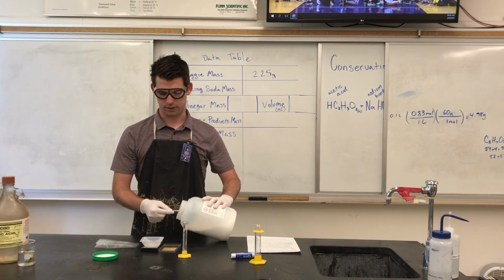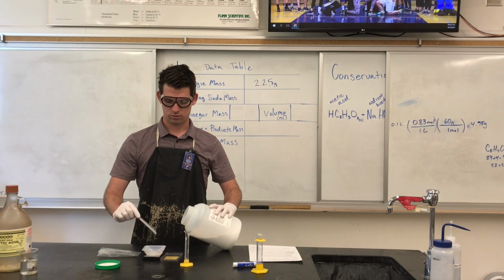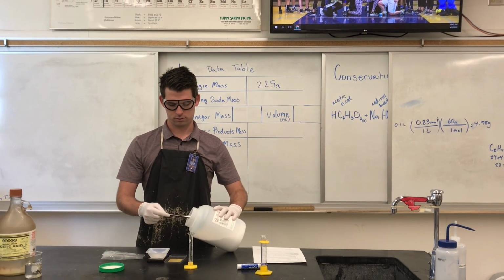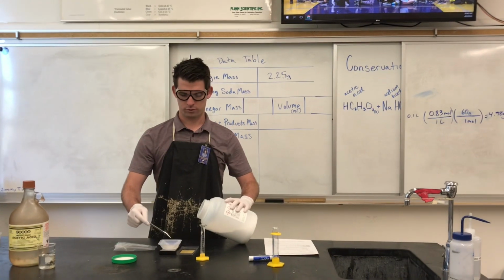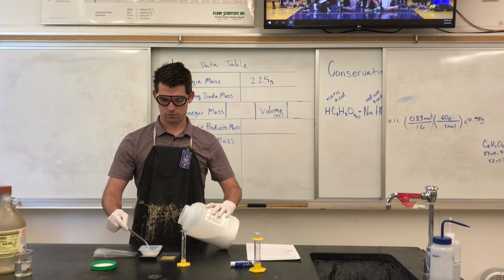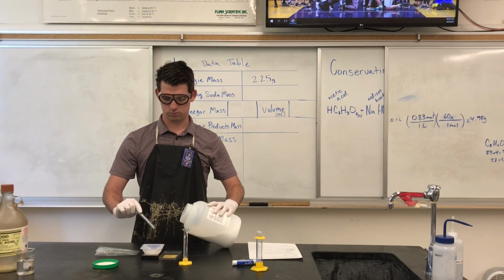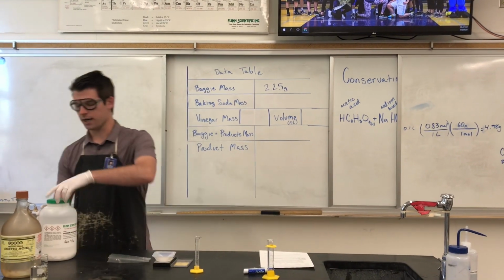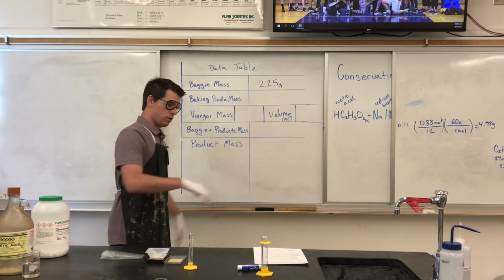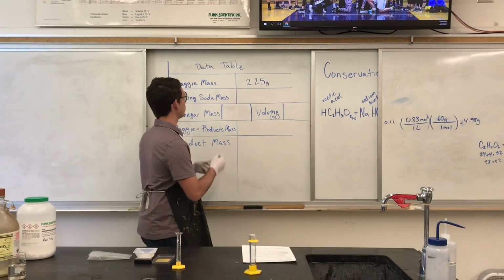Way more than that. That's 1.2, 2.3, 4.4, and oh my gosh, amazing. We got 5.02 grams.